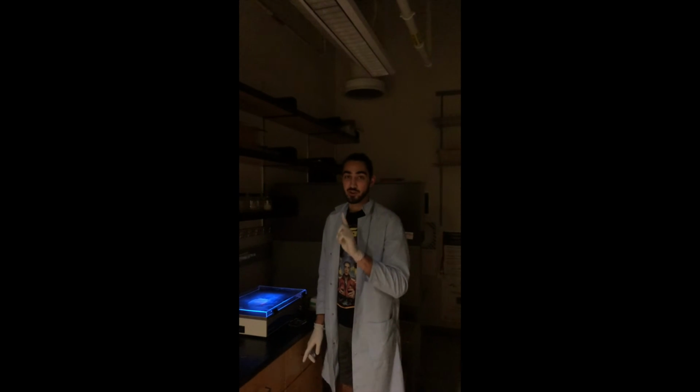Whenever you're done, you're going to want to deposit your gel into the ethidium bromide bucket. So we will do that, and we wish you guys luck in your time in functional genomics.